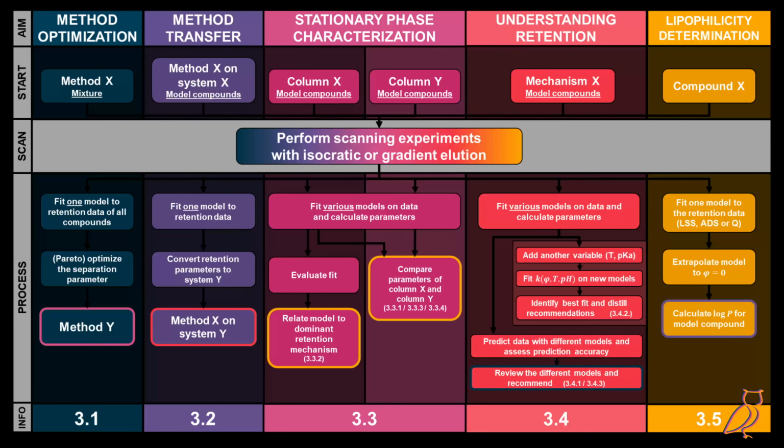So, what can we do with it? What are all these nice approaches that we made you watch this video for? Well, looking at the literature of the last few years, we actually distinguished 5 separate approaches of retention modeling, of which we made our master scheme. Looking at our approaches, we see that all have a different starting point and a different goal, but they all need to perform some kind of scanning experiment.